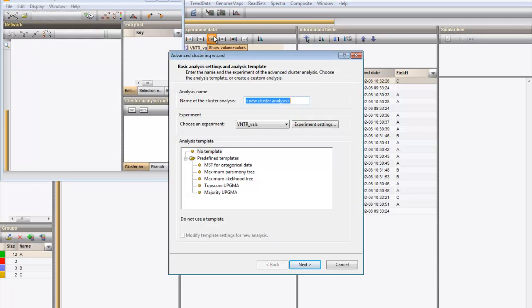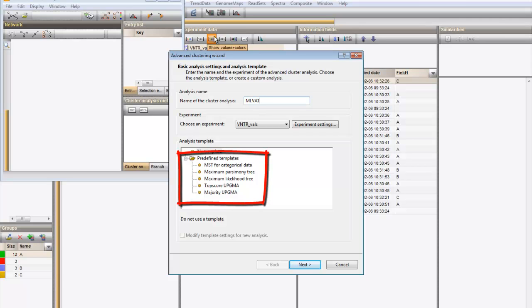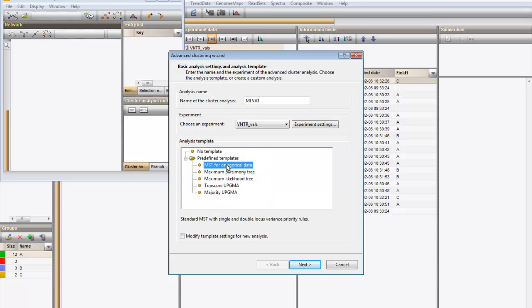Give the analysis a name. One of the available predefined templates is Minimum spanning tree for categorical data. I choose this one and I click on Next.